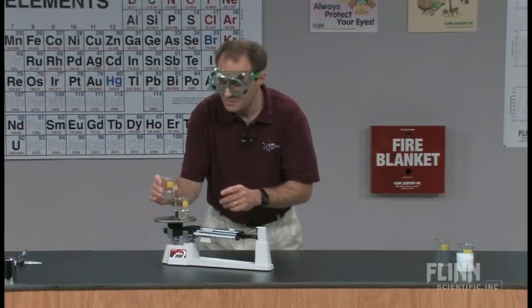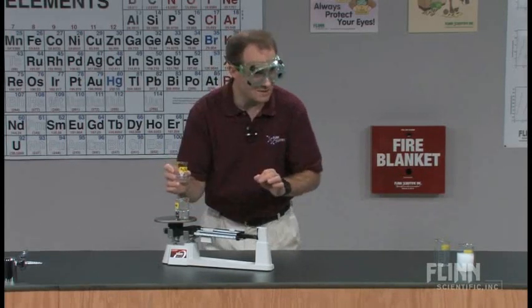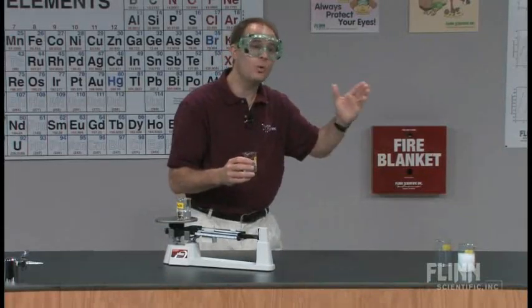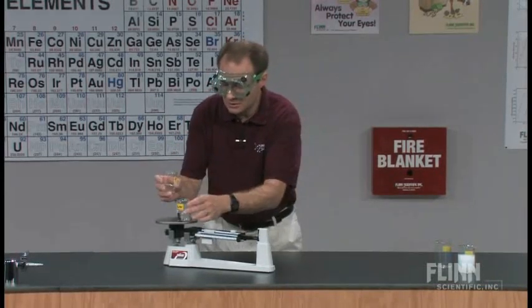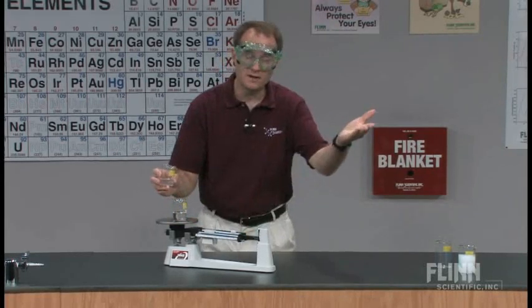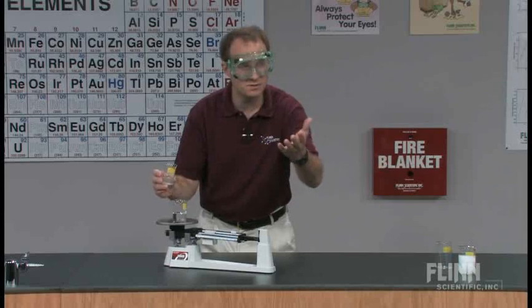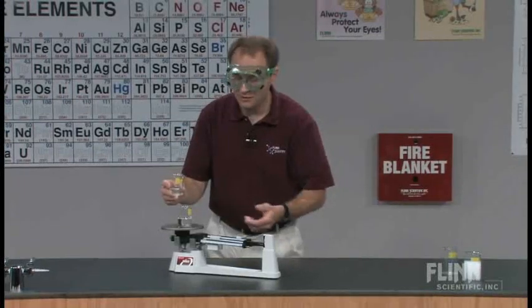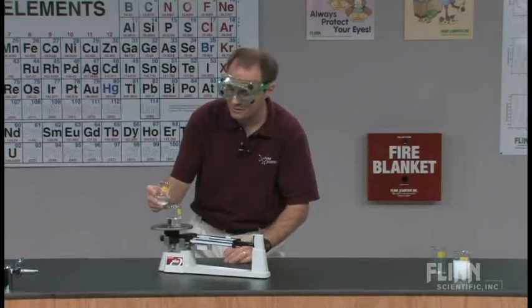I can also ask them, does it make a difference if I pour the magnesium sulfate into the sodium hydroxide? The way it's written on the board, does that imply an order? It turns out it does not. I'm going to pour this into the sodium hydroxide. We know what's going to happen, a chemical change, a white precipitate will form. Ask the students to explain their reasoning. Maybe take a vote. If you have the clicker technology, they can even chime in anonymously and you can see exactly what they're thinking.